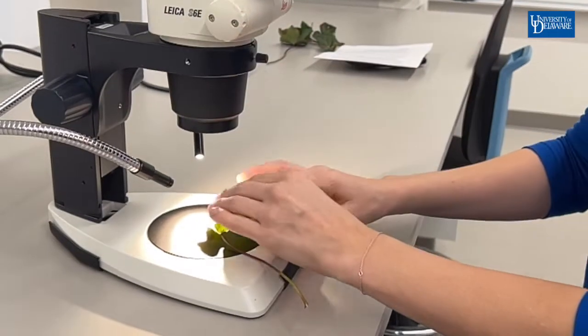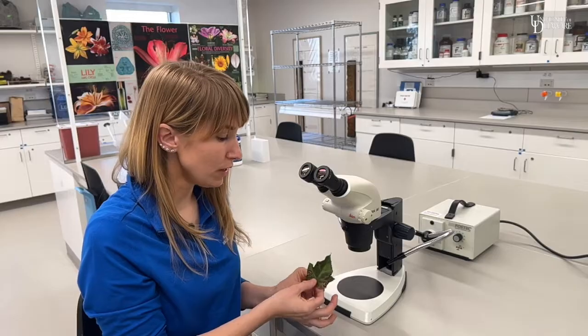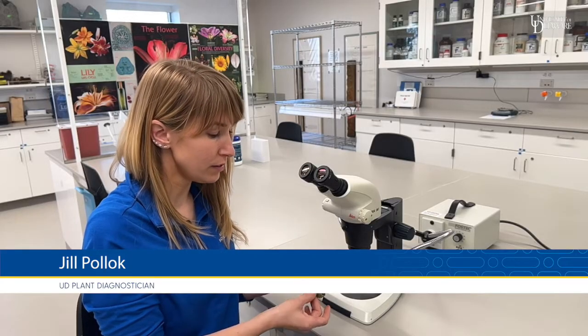Today I'm going to show you how to use a dissecting microscope, which is also called a stereo microscope. This allows you to look more closely at samples — insect samples, plant samples, anything — and it allows you to look at the surface of the sample.